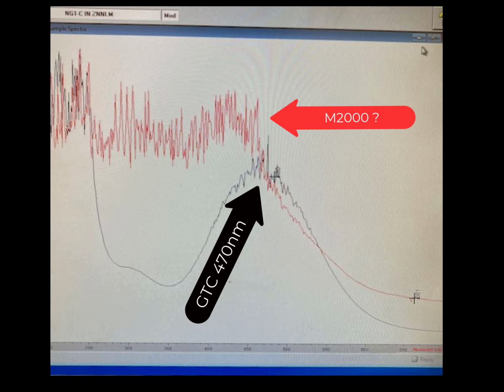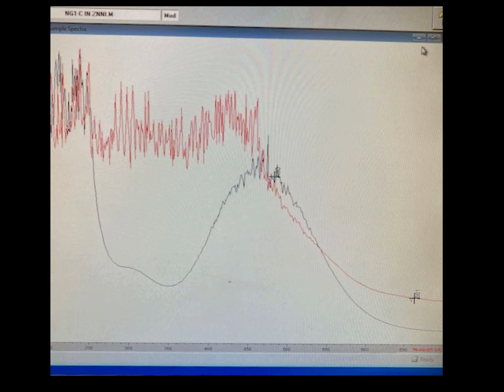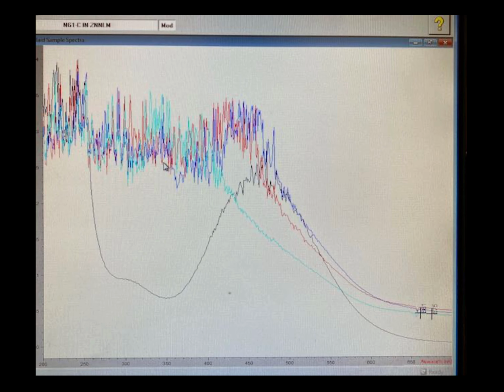But the red one, the M2000 sample, you cannot see. You cannot make out where the peak is and it's not in the same place. There's lots of interference there. The same is true with all the other samples that I received last year. The black is still just plain GTC and the other ones are just kind of a mess.